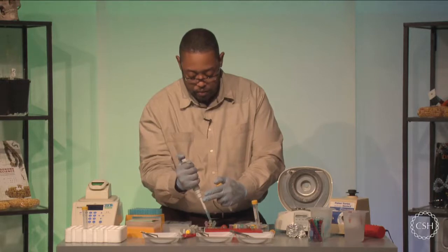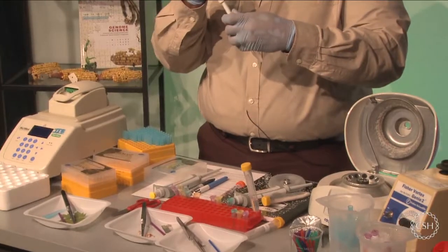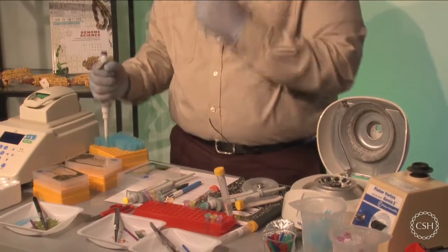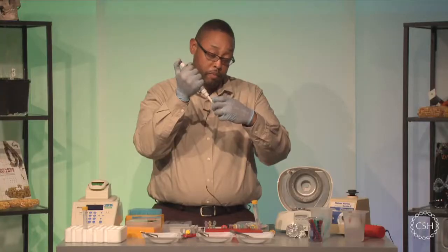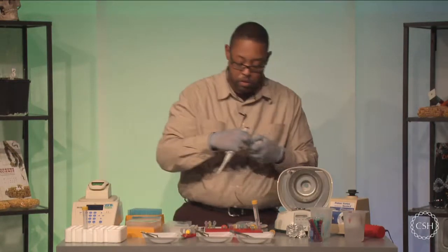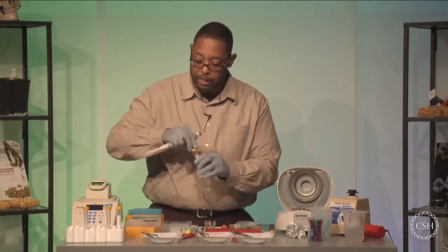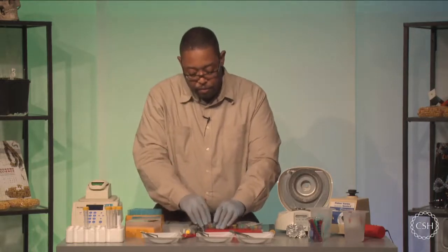So make sure you're adding your wash buffer to each test tube sterilely still. I'm basically done with my silica resin and my wash buffer. And I'm also done with my lysis solution, so I'm just going to push those off to the side. So I've added the wash buffer, the second round.